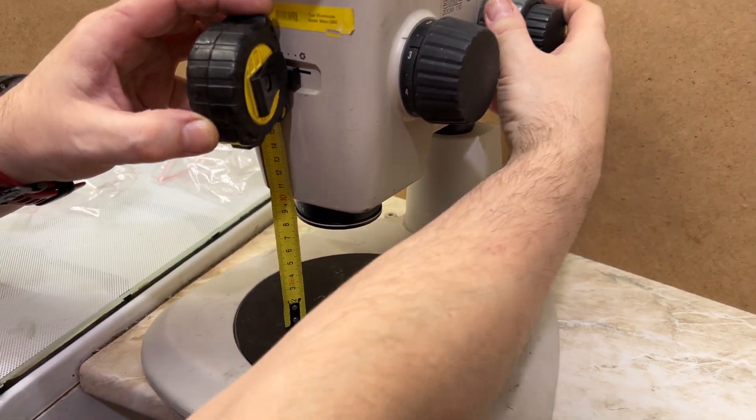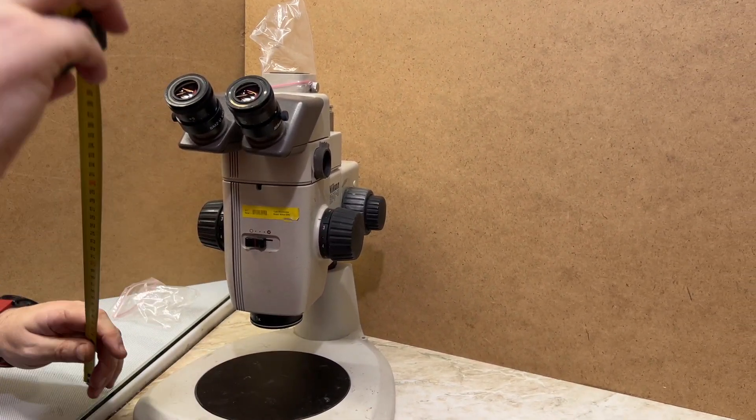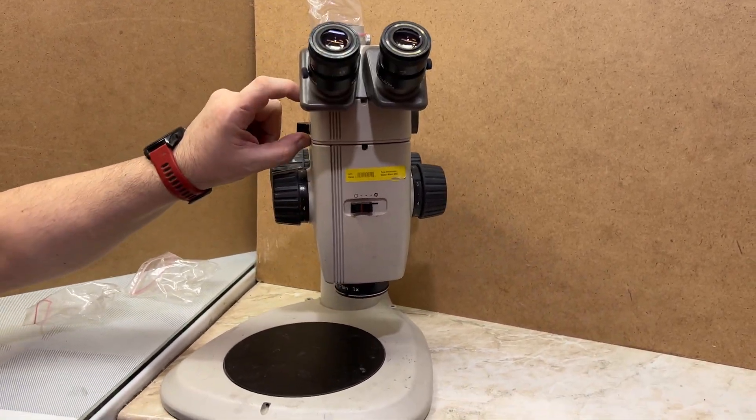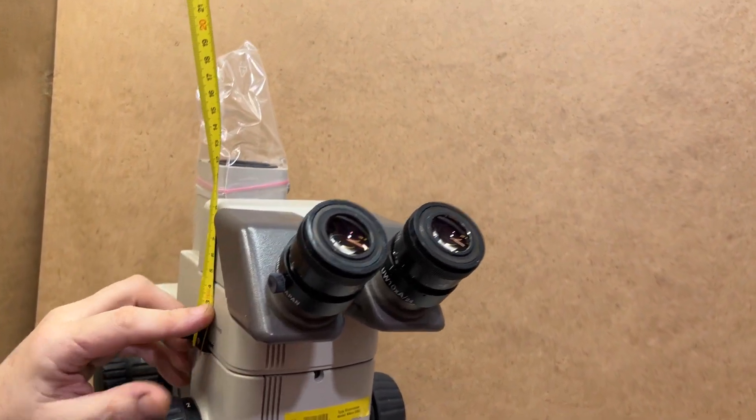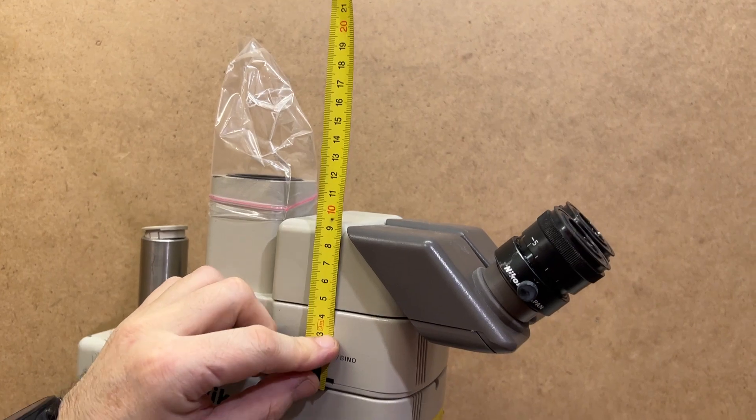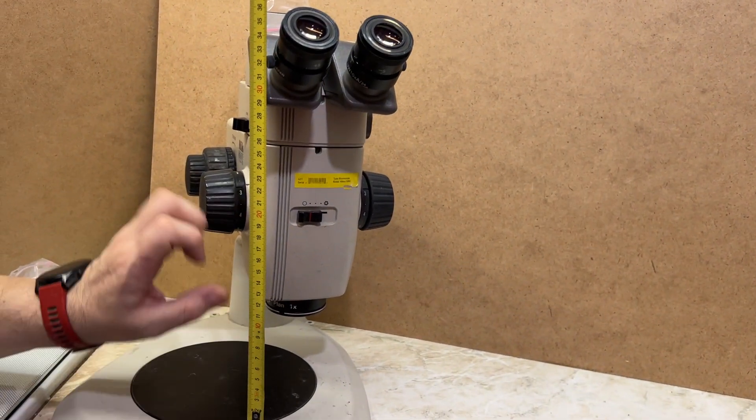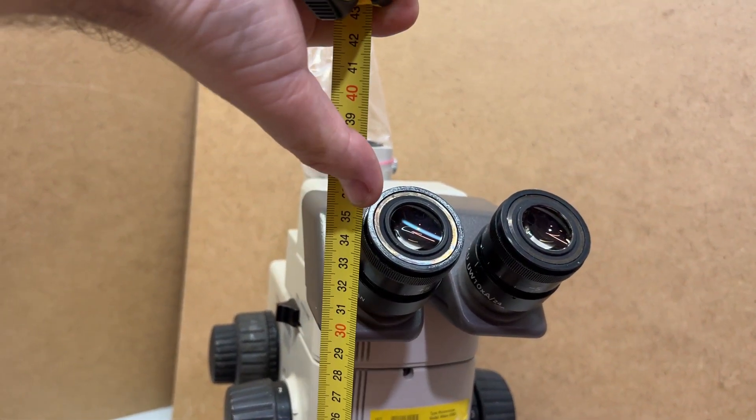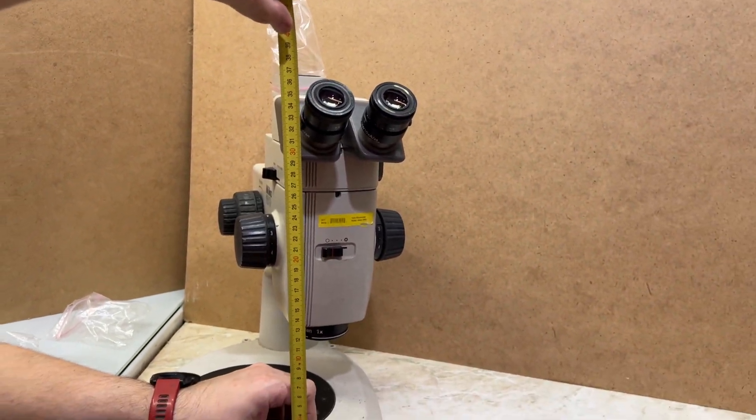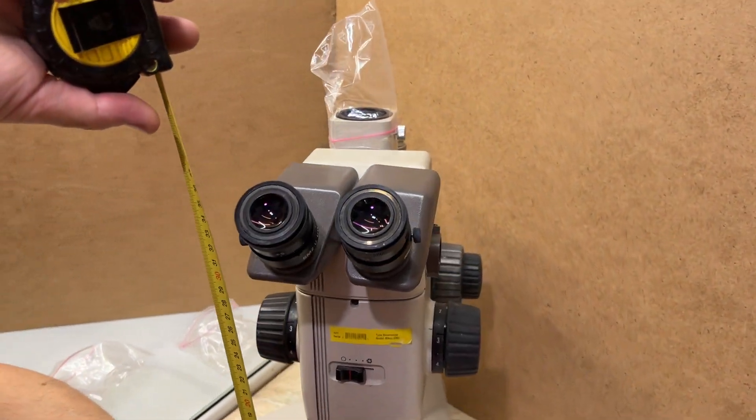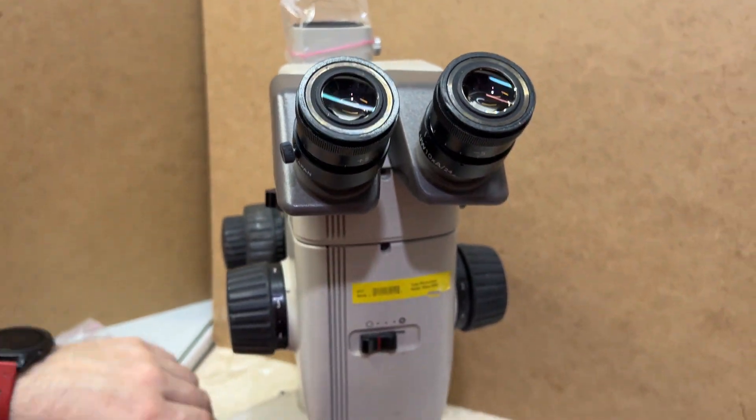We can now see what the distance is for the eyepieces with the photo splitter set on. If you take the photo splitter off, we will take almost four centimeters away. With this photo splitter, working distance is about 35 centimeters, only a centimeter over the Nikon SMZ745.